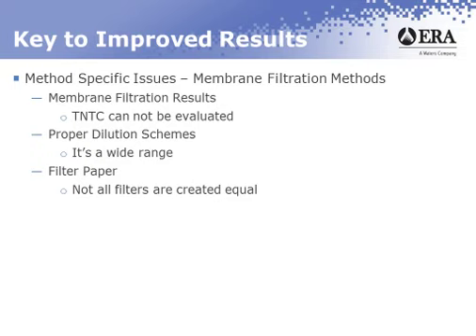Keep in mind that I've told you the organism that we use every time for the wastewater sample. You should never expect to see any kind of atypical results. These samples are not tricky in that way. You're always getting the same organism every time. So if you don't get good sheen, sometimes it can have something to do with the filter paper itself.